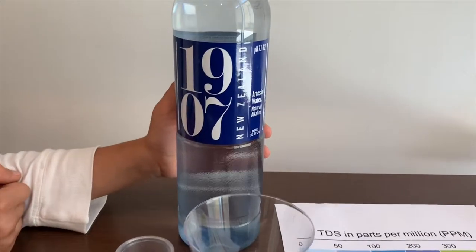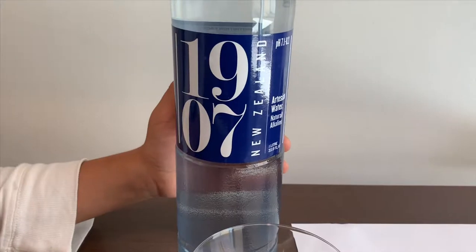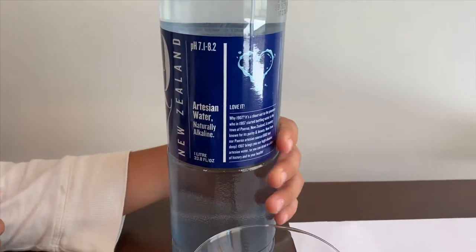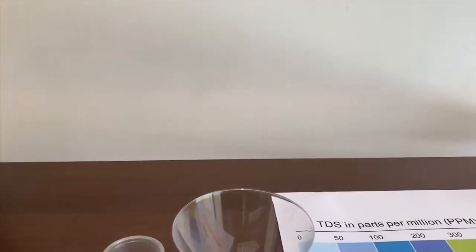This is 1907 Artesian Water. It's a product of New Zealand and it costs $2.00. It's supposed to be pH 7 or higher. Let's test and see.